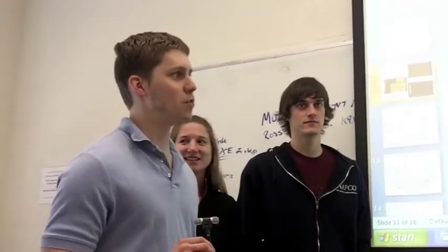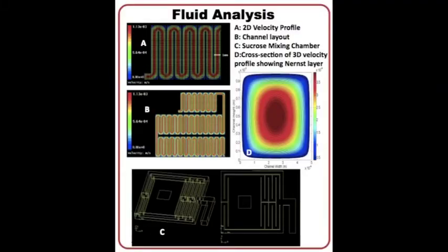We're simulating two main regions of our microfluidic chip. Right here you see the simulations of basically a reaction chamber so that all of our reactants can come together and be able to deliver the appropriate dose by the end of that mixing. We're also simulating the initial bismuth uptake chamber. It's not quite done yet, but there's a schematic over there.